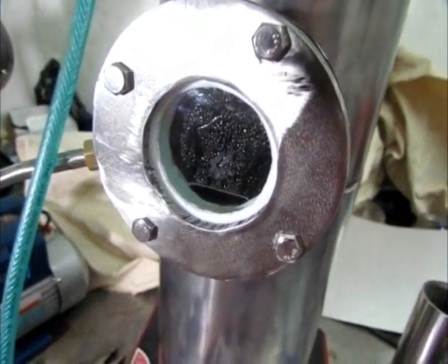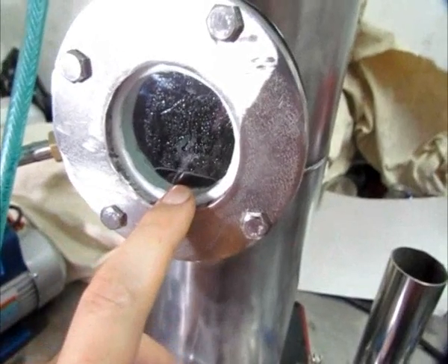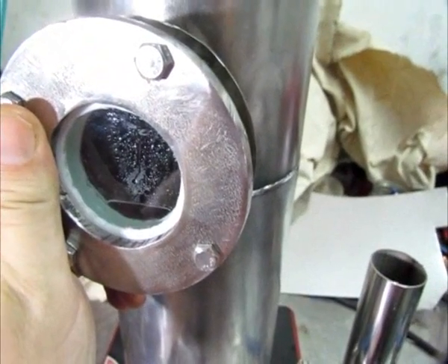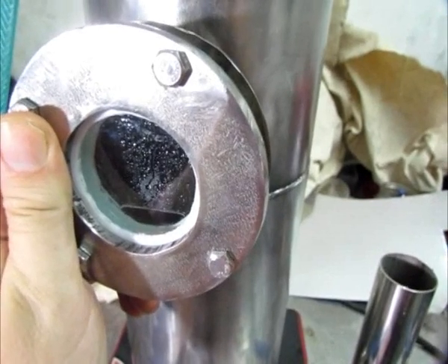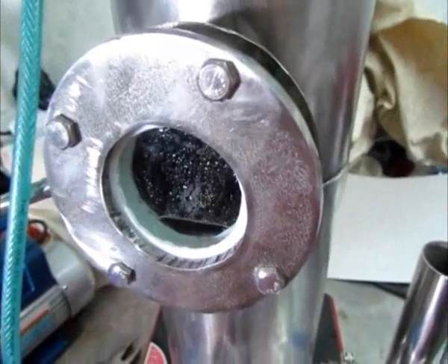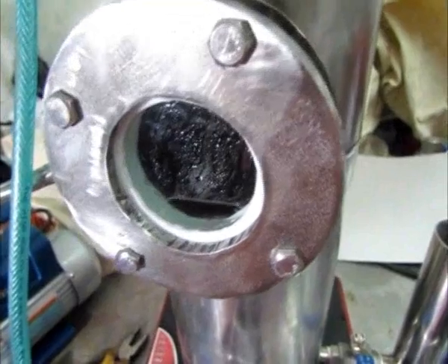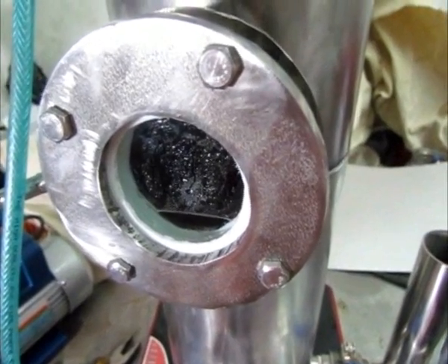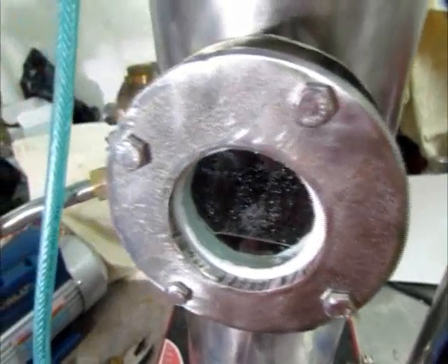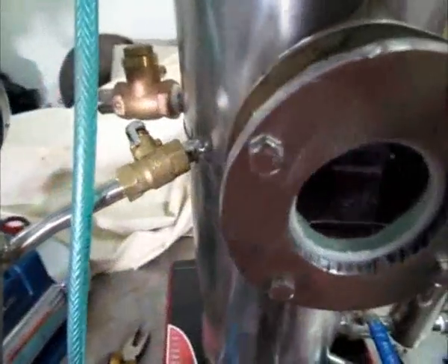I've been running the still for a few minutes now and you can see there is some product — this is the product chamber — accumulating. I'm going to show you how to take the product in fractions, meaning you can do that several times during the run, for example to separate the heads, foreshots, and hearts from the tails if you're distilling ethanol. For glassware vacuum stills, we'd normally use a device called a cow.